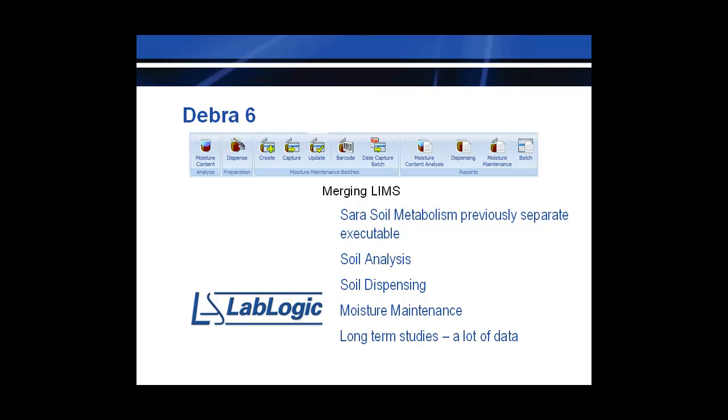Soil degradation, soil photolysis and absorption-desorption studies are increasingly performed and have their own unique data requirements, both for the analysis of the starting soil moisture handling properties, dispensing of the soil by dry weight or volume, and monitoring of the moisture content during the course of the study. With these projects often being quite long-term, collecting data over a 6-month period and involving numerous soil samples as well as trap and residue analyses, the data quantity that needs tabulating and checking is well suited for collection within Debra.